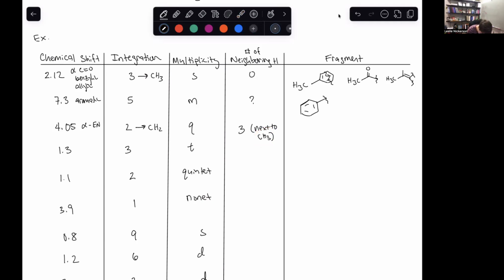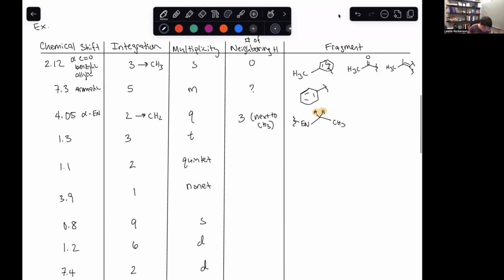So what this gives us is we know that we've got our CH2 here, and this is the thing that's actually creating the peak next to a CH3 that is connected to some kind of electronegative atom that is connected to something, possibly. Okay, so that's helping us get a lot of information out of that very small little line of data. Okay, next one, 1.3.